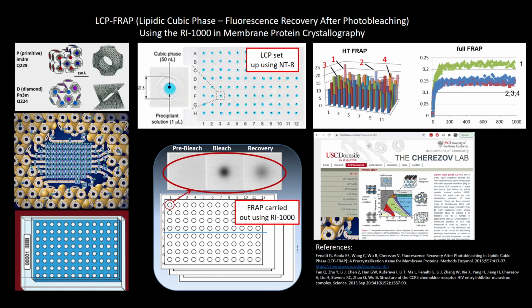And then there's also full FRAP, where in a condition of interest, a single bleach spot is monitored for 30 minutes, and that gives us a rate of recovery as well as an interpolated total recovery, and that's shown here. Vadim Cherezov has pioneered much of the work with LCP, and his website is full of resources.